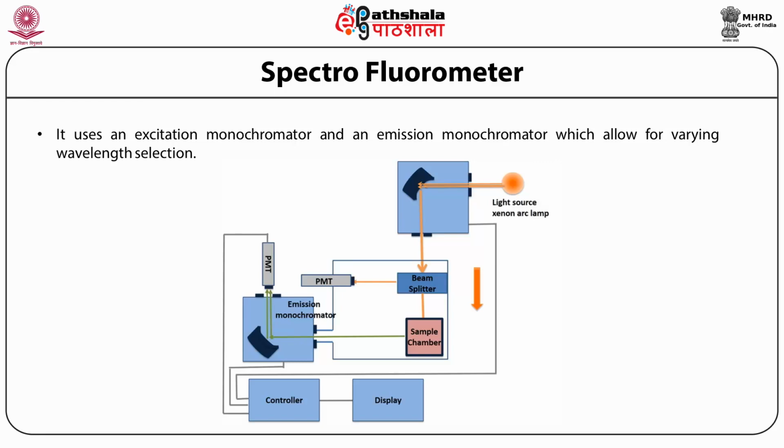For research purposes, the spectrofluorometer with optical sensitivity and specificity, containing monochromators with continuous variable slits and a broad wavelength range of 200 nanometer to 1000 nanometer, have been preferred. Such instruments have dual excitation or dual emission monochromators for increasing sensitivity and reducing stray light.